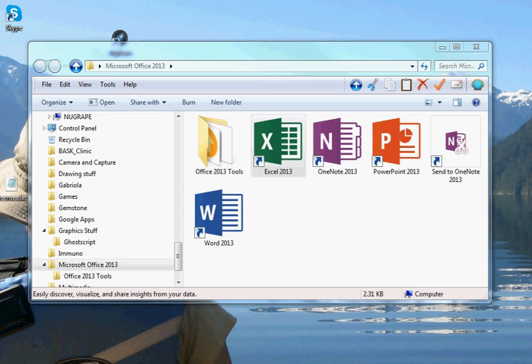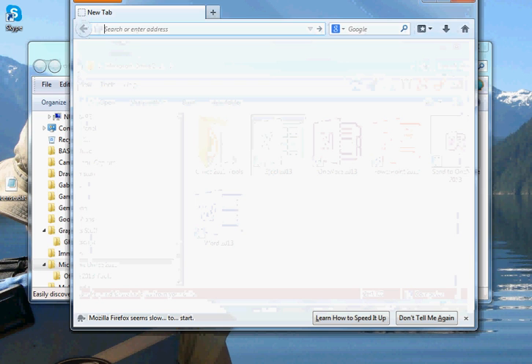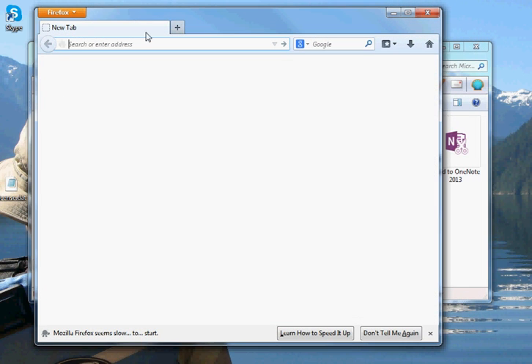I'm going to show you how you can get it via FTP. This assumes that your desktop machine is on the network with the Dynaview. It may not be possible in your case, but here it is. So that's what I'm going to do. First I'm going to open up Firefox. Turns out that Microsoft Internet Explorer does not work for this for some reason. Any FTP client or Firefox or SeaMonkey, they all work, but IE does not.